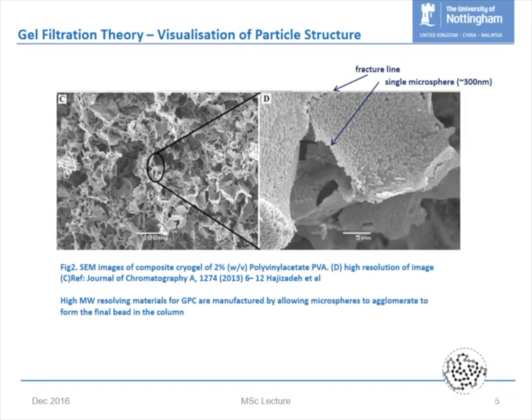Okay, so now I'm going to spend a little bit of time talking about the actual phase itself.